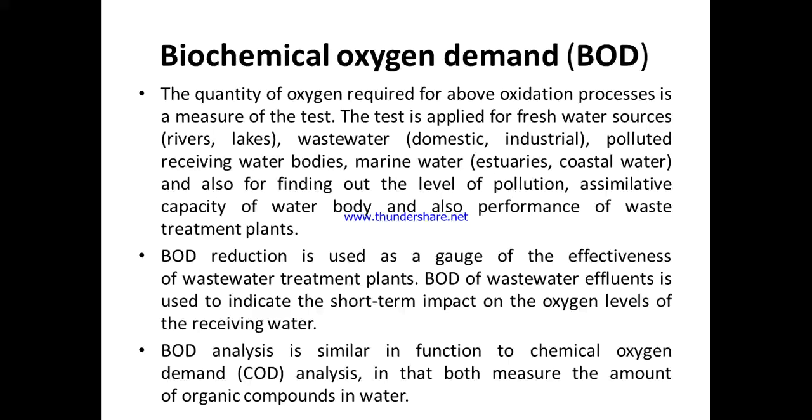Dilution ratio is basically the ratio of volume of diluted sample divided by volume of undiluted sample. For example, say we are taking 10 milliliter water sample. हम कितना ले रहे हैं? 10 milliliter water sample ले रहे हैं, and we are adding distilled water into the water sample so that we increase the volumes to 100.